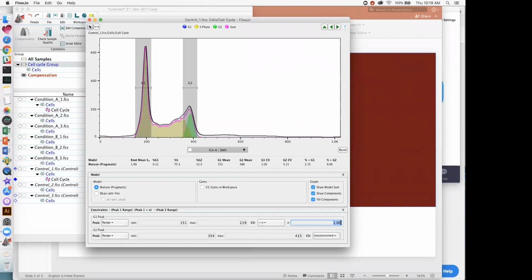Instead of having it be around 7, what we're going to do is maybe fatten that up to about 10, and just see what happens when we increase that width. Okay, see how the histogram is a little bit more tapered towards the bottom here, and a little bit fatter overall with respect to the model.